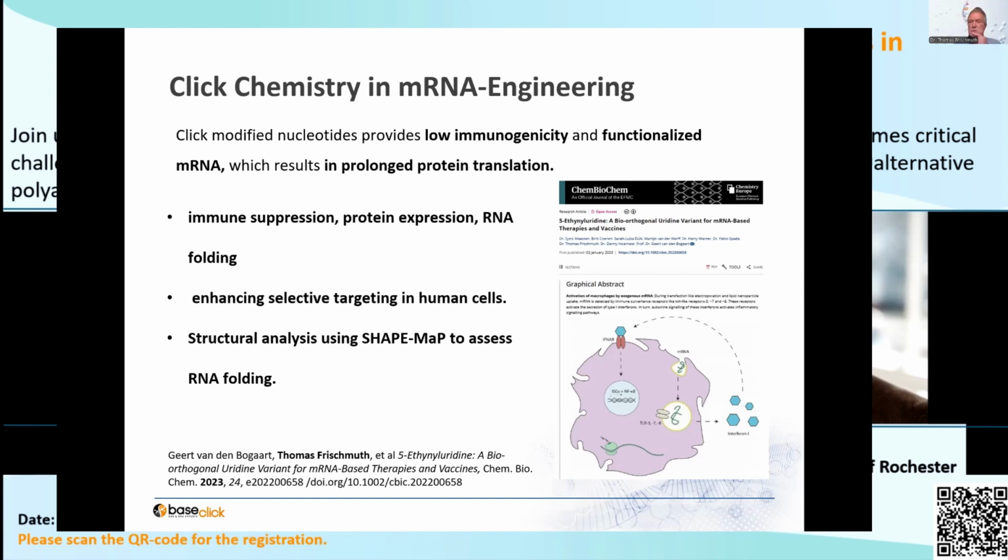That shows you how sensitive this method is: click chemistry is able to undergo chemical conjugation with a molecule which is very sensitive to changes in pH or other kinds of acidity and so on.